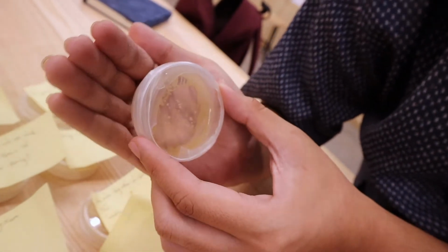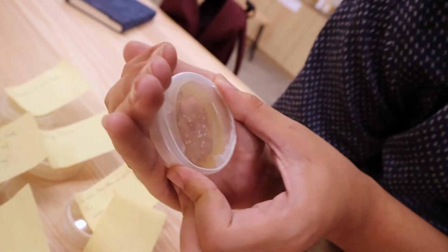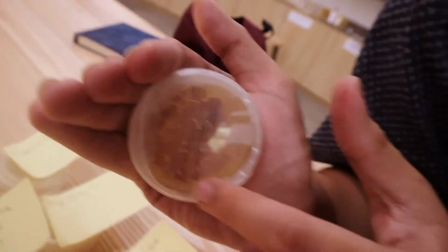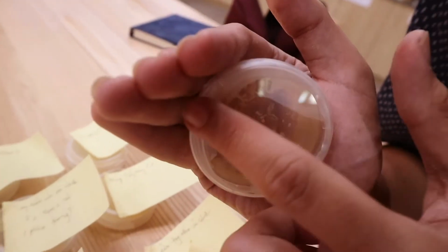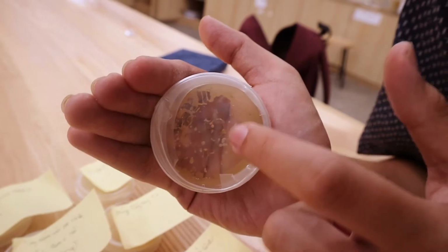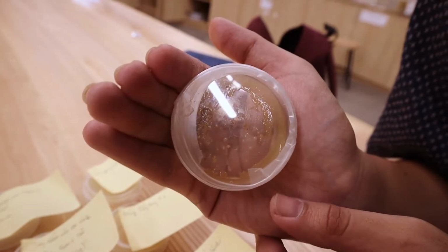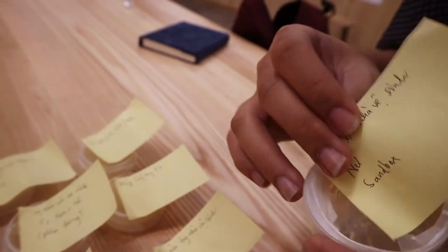Okay, this is the thing that we collected from to draw the B shape. Well, with this wild distribution of things, there's this yellow thingy that is concentrated at the rim of this plate. And E. coli seems to be less prevalent in the bum gun. So I think that the yellow thing comes from your butt. I have a feeling that it comes from your butt, but it's not E. coli.